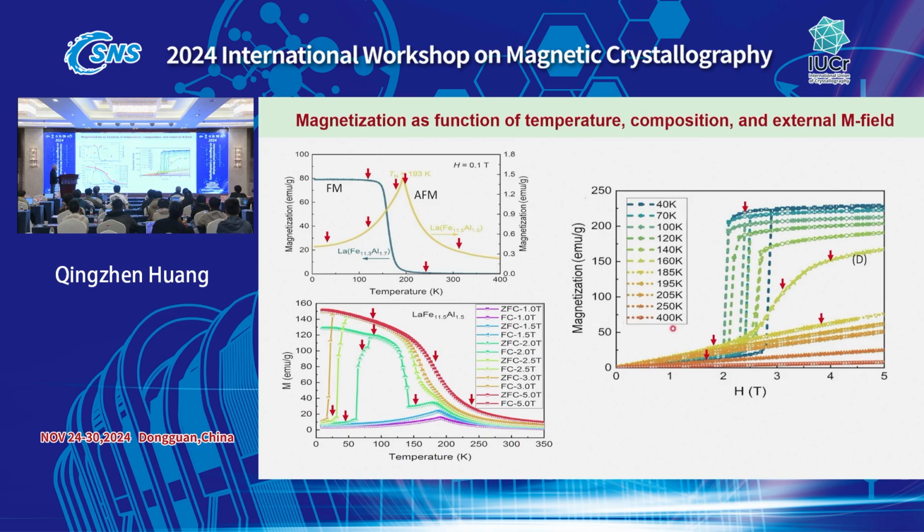At a certain temperature, you increase the magnetic field to collect the data. From this kind of curve, you need to collect data, for example, at such a rate, where the order begins to change. Or it looks like a second order change, but it's different. So you had better collect data at these three points.